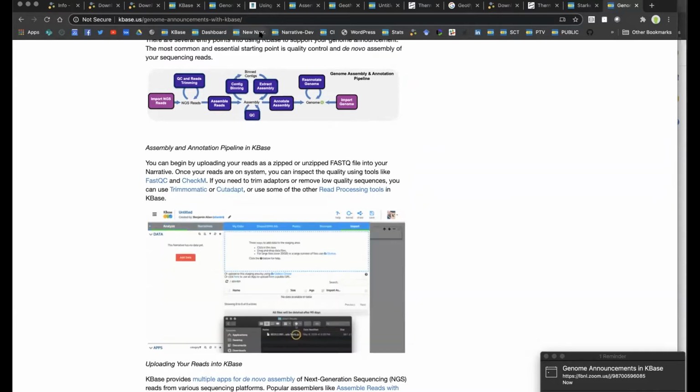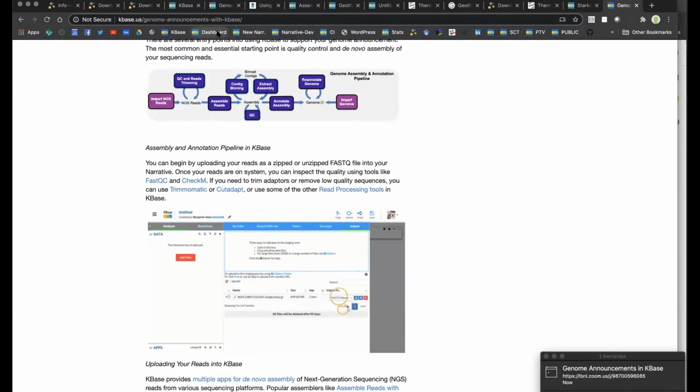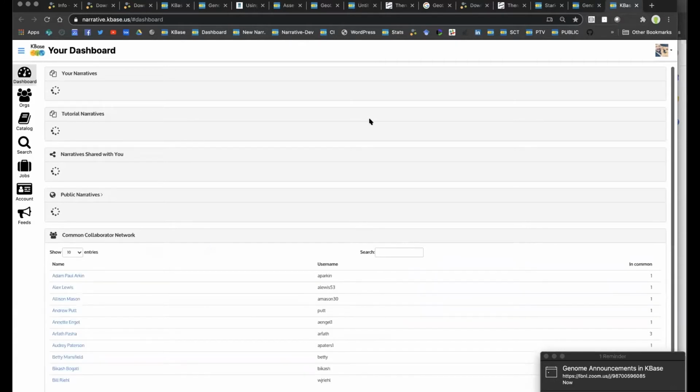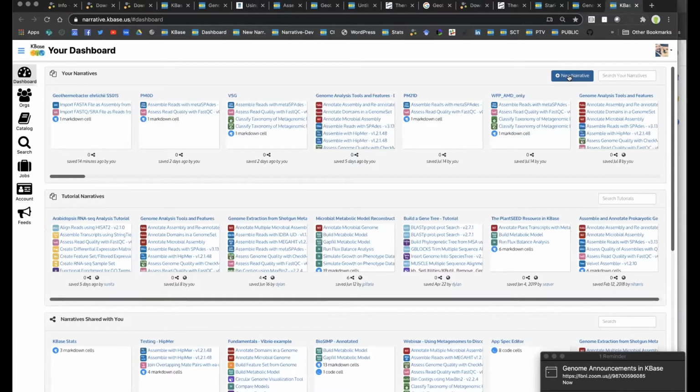So I'm going to open up a new narrative here, and rather than use my tricky way, I will open it the way that you all probably tend to do it, which is from your dashboard. Once this loads, I'm going to make a new narrative using this new narrative button.